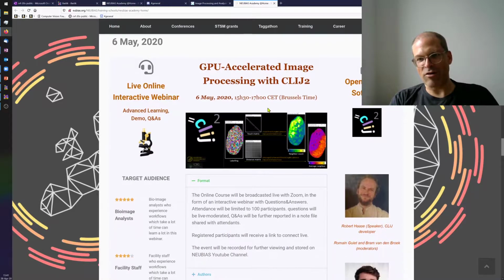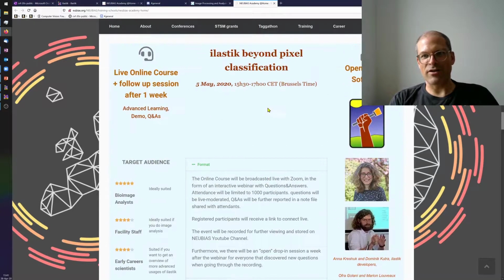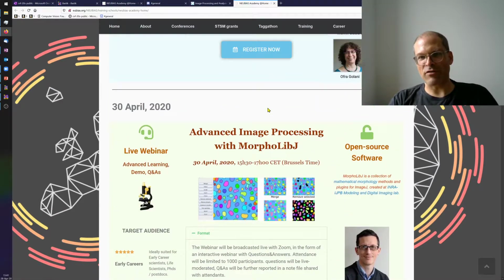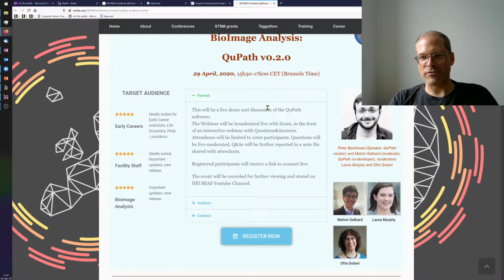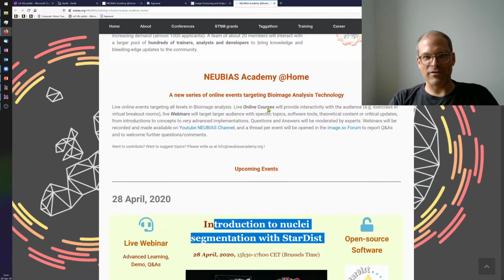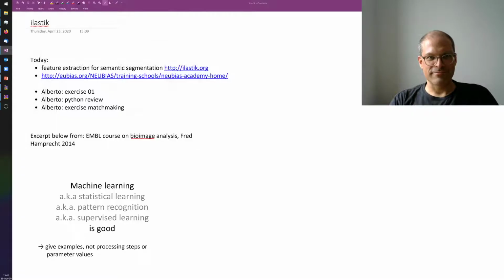They are pretty interesting for taking the first steps towards solving a particular problem, and then often you need a little bit of post-processing or hand coding to finalize the result. So everything featured here is really useful and interesting.